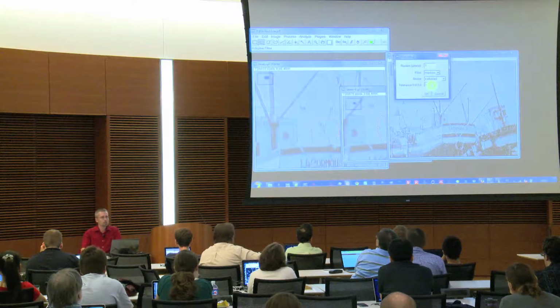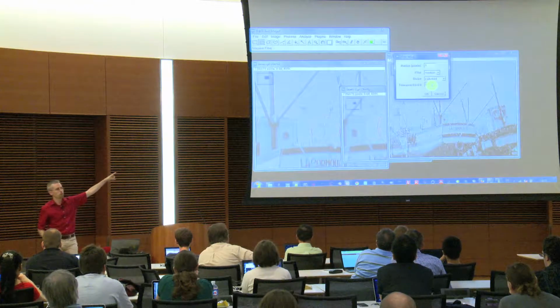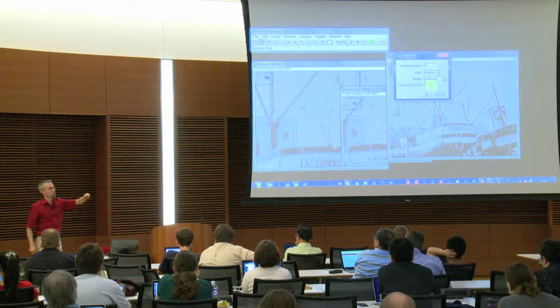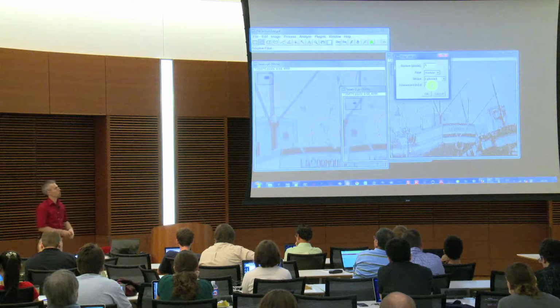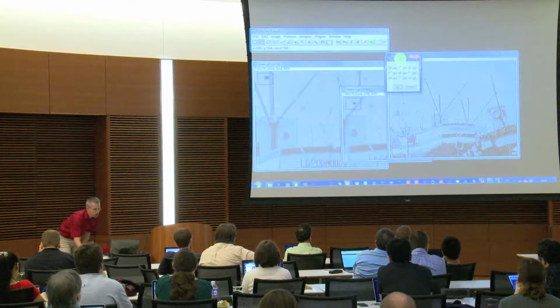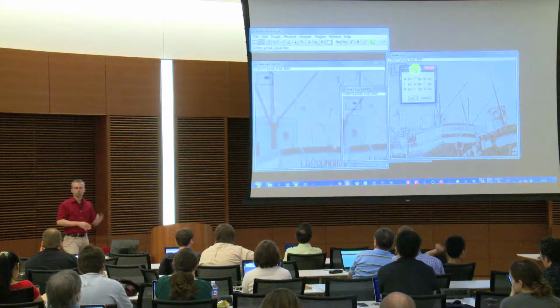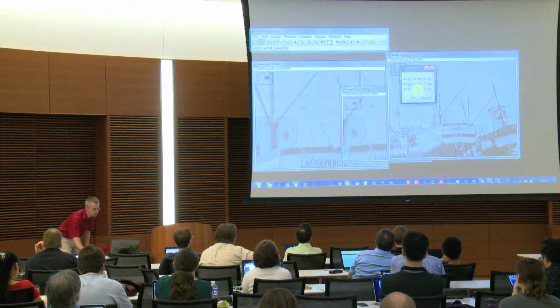So what the program does is it filters the image with a median of radius 1, exactly what we did before, and then compares this to the noisy image and exchanges only those pixels which have at least 15% of difference before and after filtering. So X shape comes now. X shape is basically that. That's also why it's called adaptive filter, because you can tell the program use only these pixels for filtering and skip the other ones. And X means simply, as you see, which ones are active. Now we need all of them, so I reactivate them.